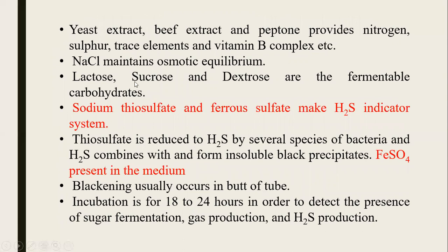Along with these sugars and indicator, the media also contains yeast extract, beef extract, peptone, sulfur, trace elements, and vitamin B complex, etc., along with sodium chloride to maintain osmotic equilibrium. It also contains sodium thiosulfate and ferrous sulfate, which make the hydrogen sulfide indicator system.